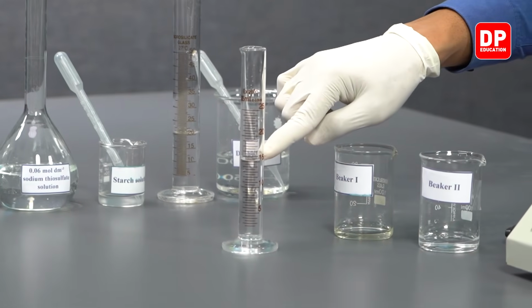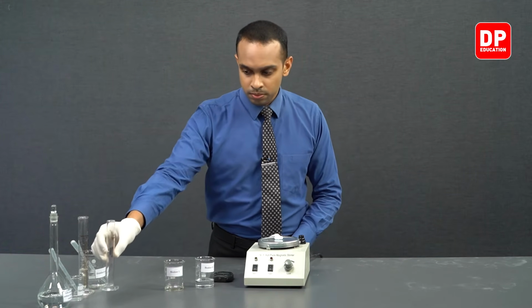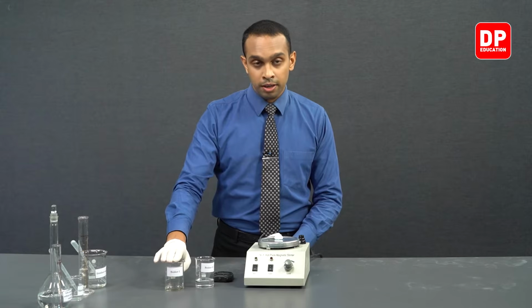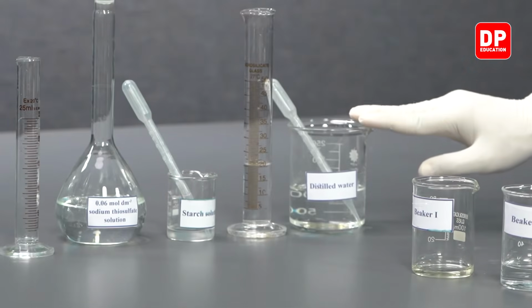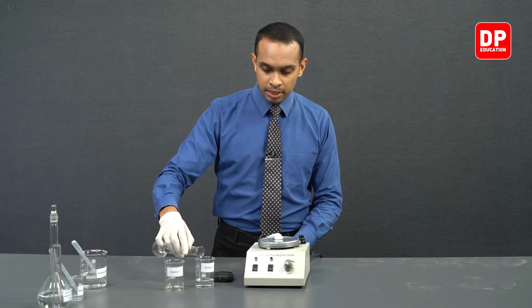As you can see, we'll be transferring it into beaker 2. And since we are taking only 5 cubic centimeters of Fe3 plus, we need to take 20 cubic centimeters of distilled water. So we have 20 cubic centimeters of distilled water measured here. We'll be adding that as well.